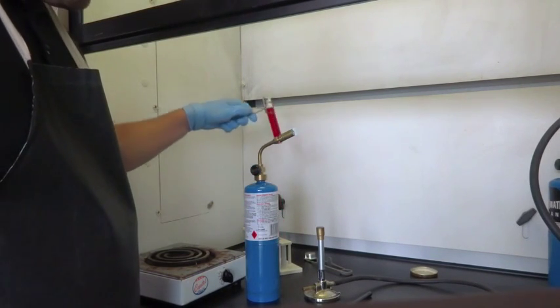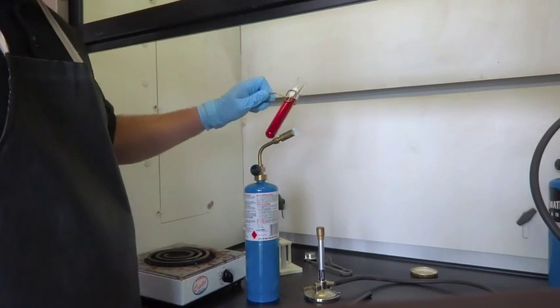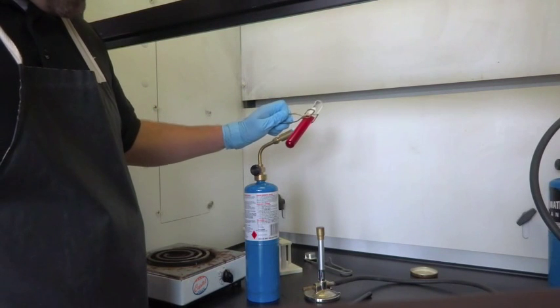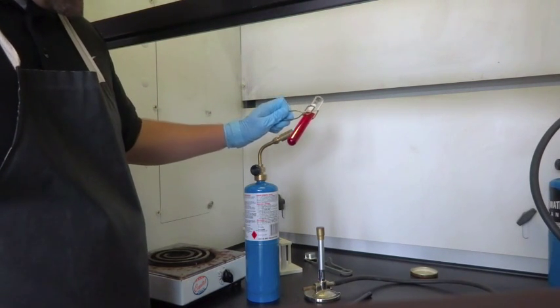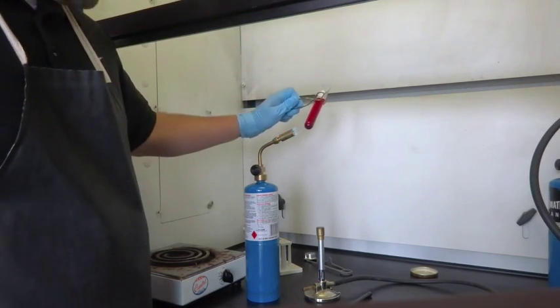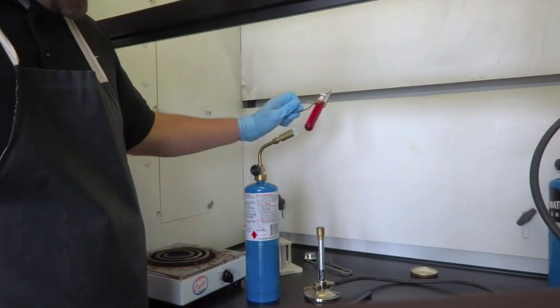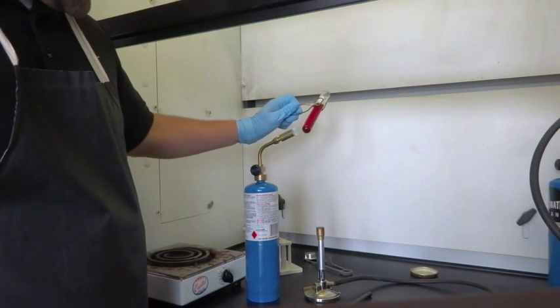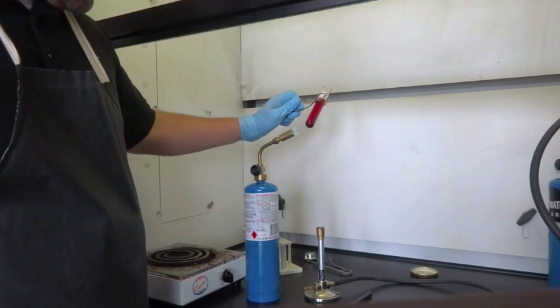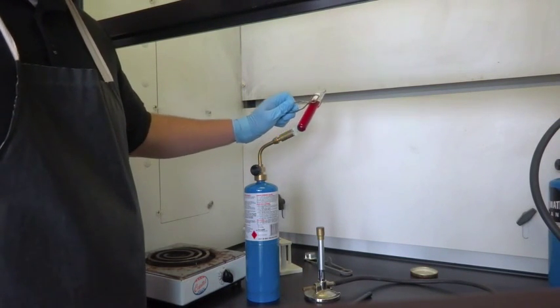When heating chemicals, always heat with the opening facing away from you or anyone else. Also, run the test tube up and down the flame so as to heat it equally and not in just one place. This makes it less likely to boil over.